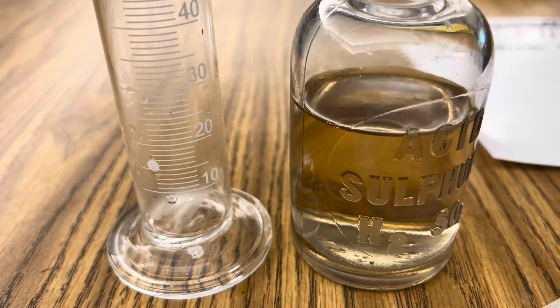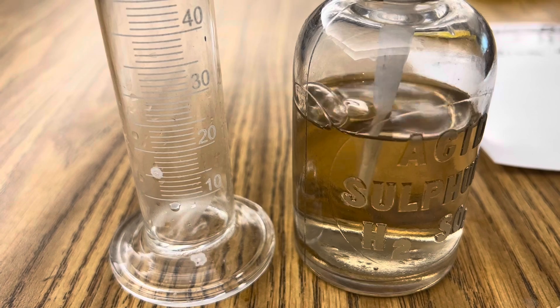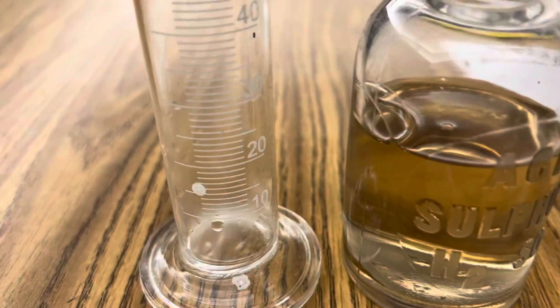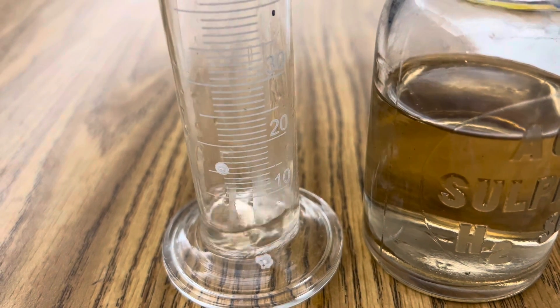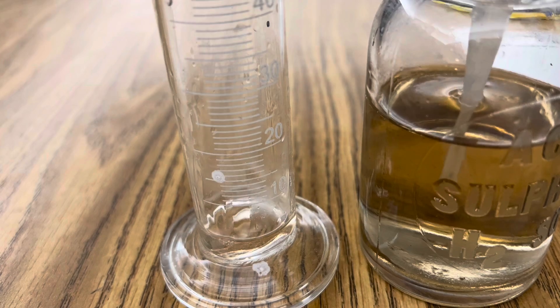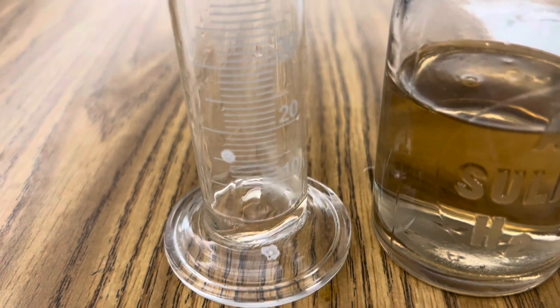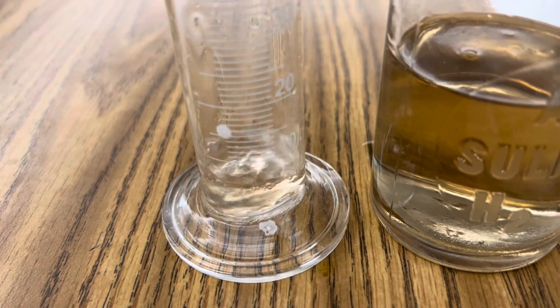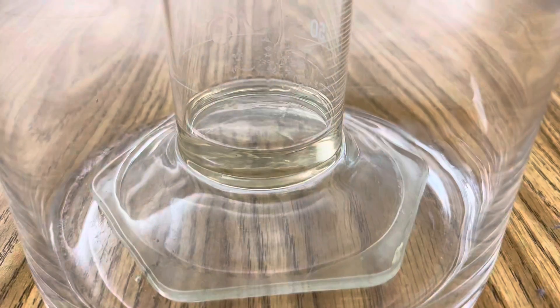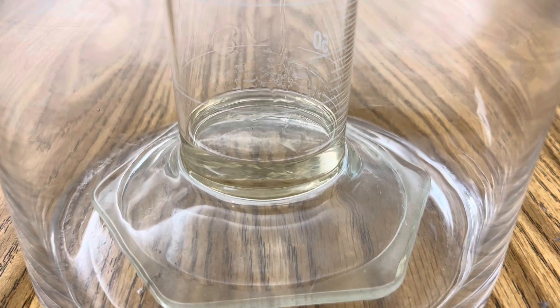The first step in this reaction is to add 18 molar sulfuric acid to a graduated cylinder — just enough to coat your potassium ingot. You don't need a lot. That's plenty. And now you're ready to add your potassium.